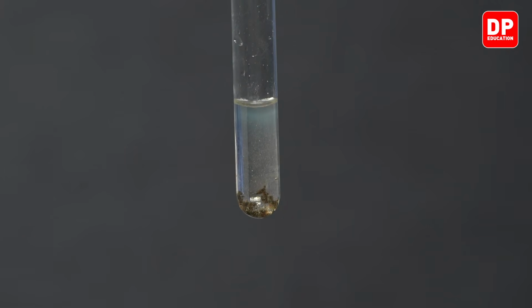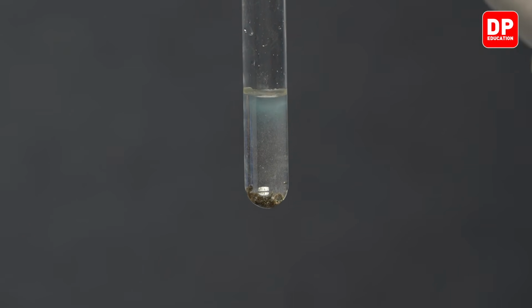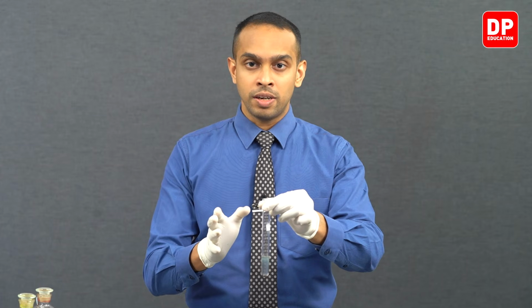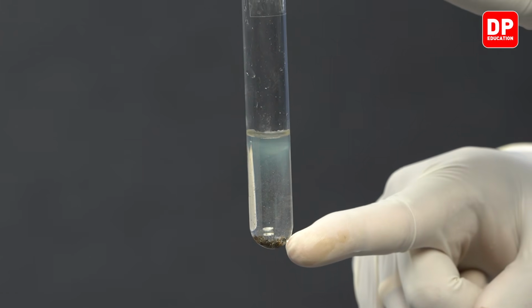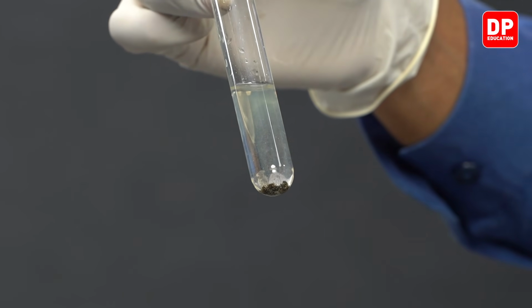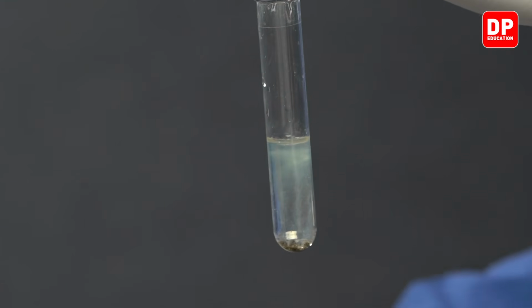So as soon as we added silver, we saw the formation of silver thiosulfate. As silver thiosulfate is unstable, it decomposes to form silver sulfide, which is a black precipitate. As you can see over here at the bottom of the test tube, we can see a black precipitate that is formed. Let's observe that one more time.